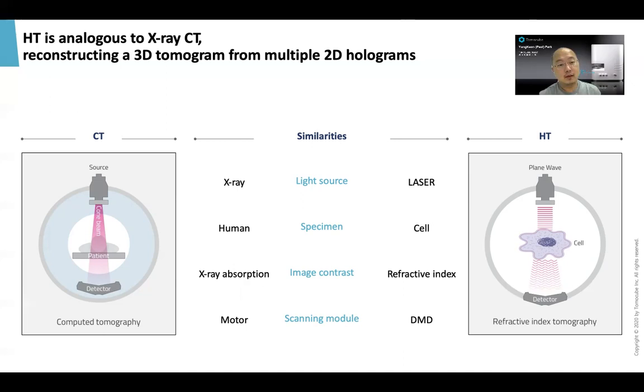The conventional X-ray CT utilizes rotations of source and detectors using mechanical motors, and they can realize three-dimensional scanning. But in the case of the Tomocube HT machine, it uses the DMD, or digital micromirror device, in order to systematically control the illumination angles without moving parts, so that it can ensure highly stable measurement of 3D data.